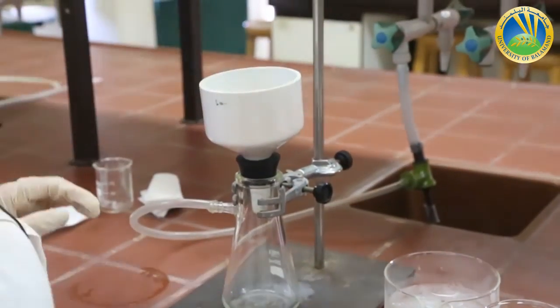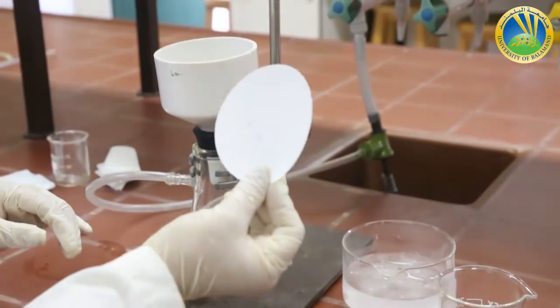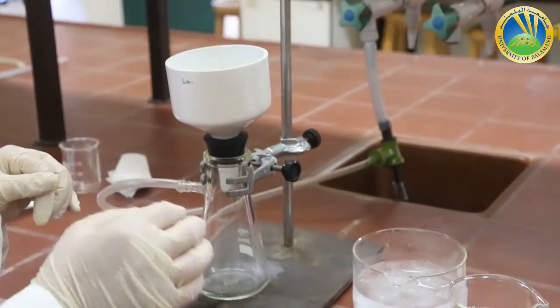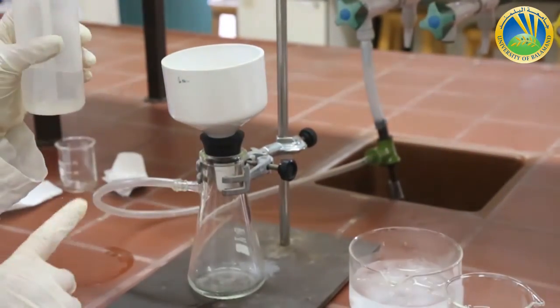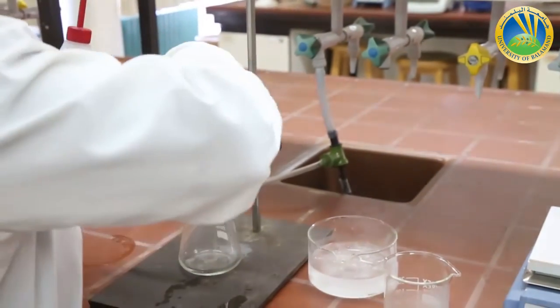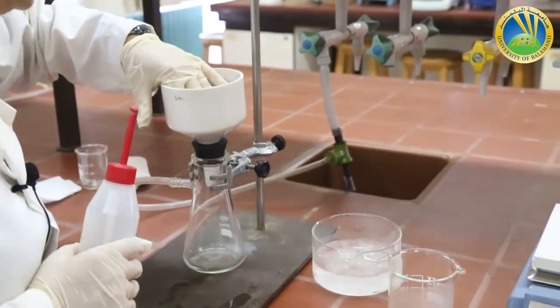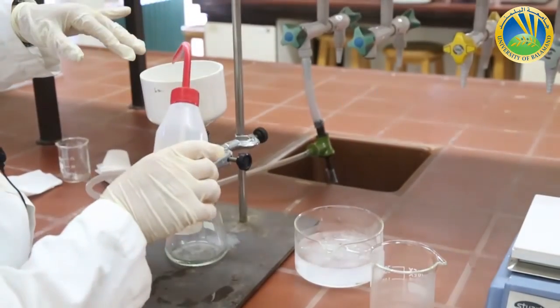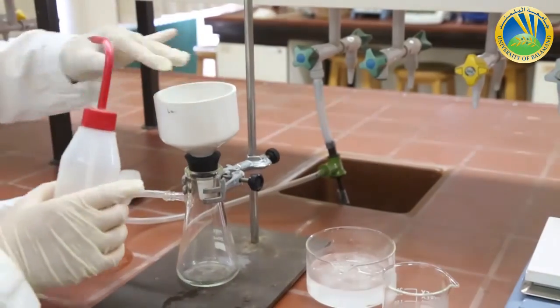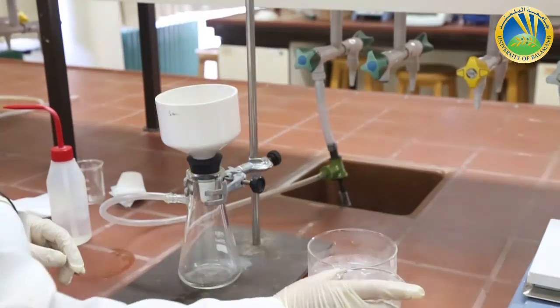Okay, now I have to weigh a filter paper and know its weight exactly, which is 0.55 grams. I put it inside the funnel of the Buchner. I have to let it stick with little amount of the same solvent as my crystals, which is water. I have to let it fix well to have the vacuum inside later on when I turn it on. Now my Buchner filter is ready to do the filtration and to collect the crystals.